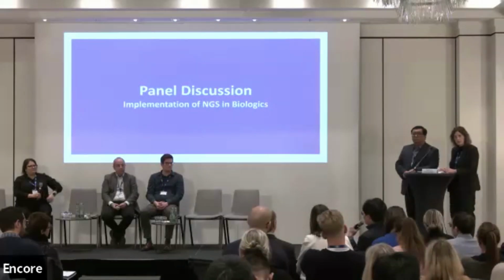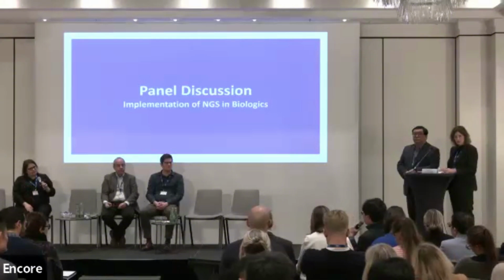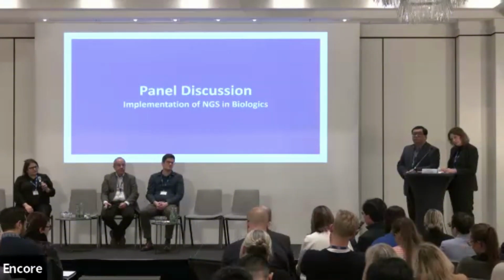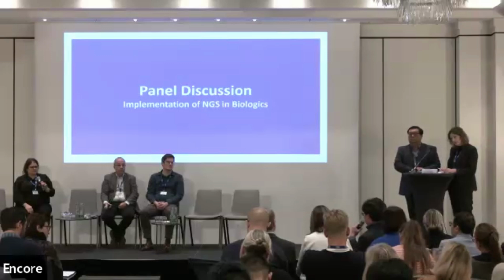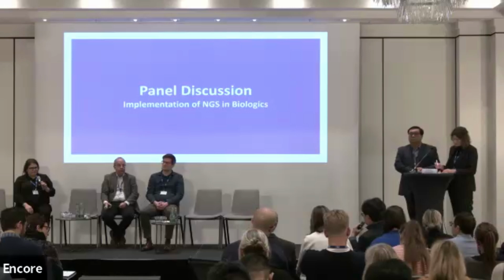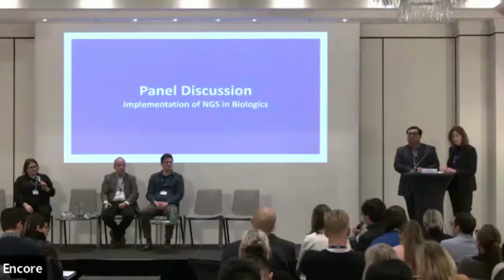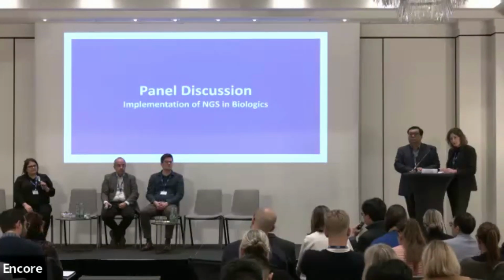So I have a question for Vanessa. GW Hive, we used to host our RVDB layer probably 4 or 5 years ago. They just provide lots of support, and also they are the main initiator along with FDA regarding this biocompute object.